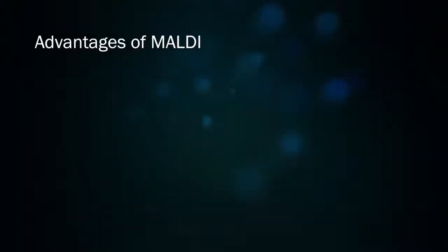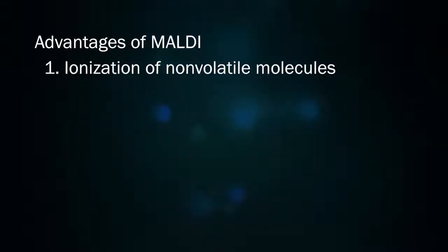MALDI offers a number of advantages over other forms of ionization, such as electron impact. The most important advantage is the fact that large organic molecules, such as synthetic and biopolymers, simply cannot be brought into the gas phase and ionized by conventional gas chromatography. The relatively recent introduction of MALDI and electrospray ionization has allowed for the study of molecules that were previously too large, polar, or otherwise non-volatile to be ionized in the gas phase.